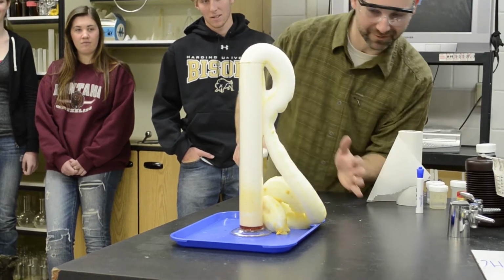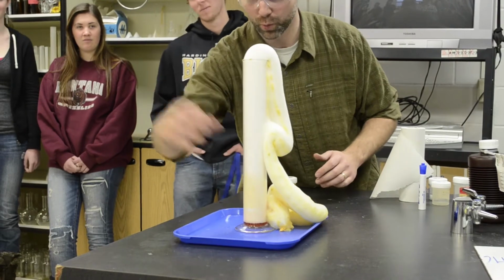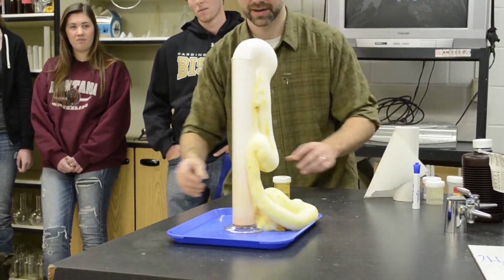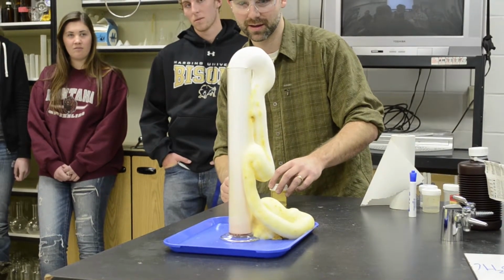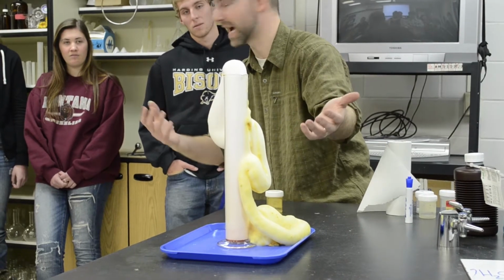I don't want to touch it. Burn myself again. So the soap is in there to show you that a lot of oxygen gas is being released, right?